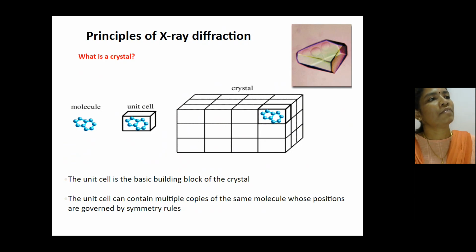When you rotate the crystal in front of the X-rays, the atoms diffract them. When the same atoms diffract the waves, they reinforce each other. So the wave principle is there, that is Bragg's law. Based on that, even though many monomers are there, they will produce a diffraction pattern of a single molecule, which can be used for the accurate determination of the protein structure.